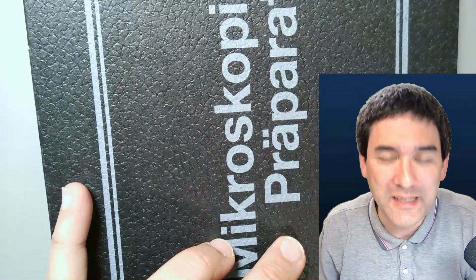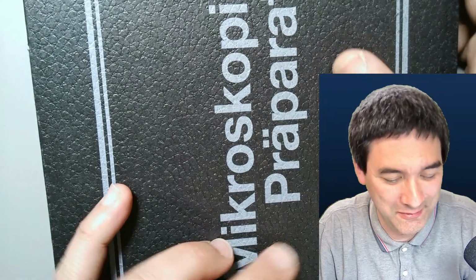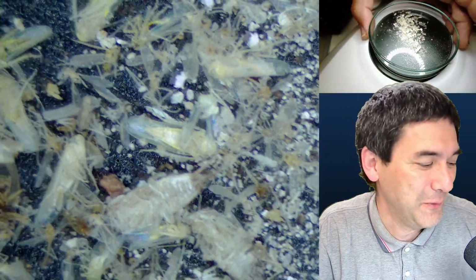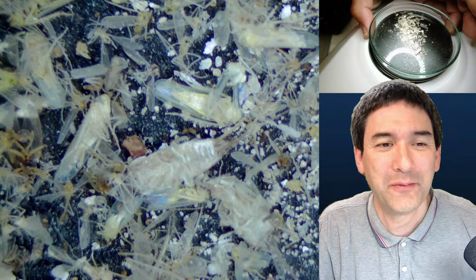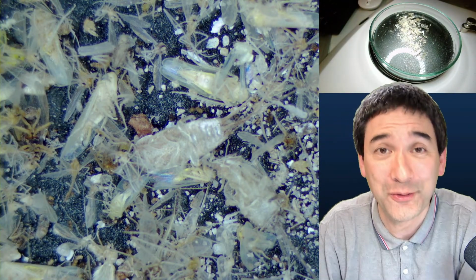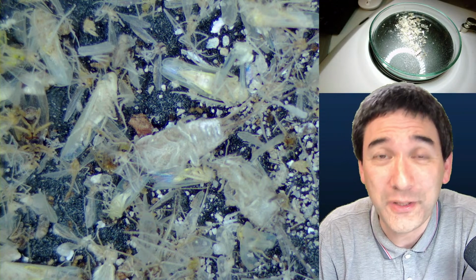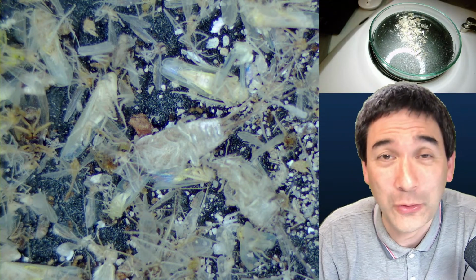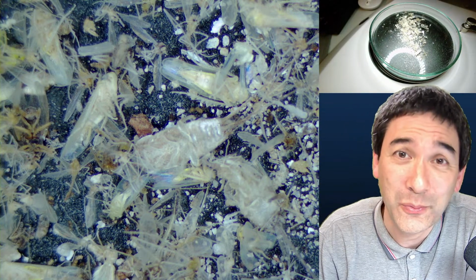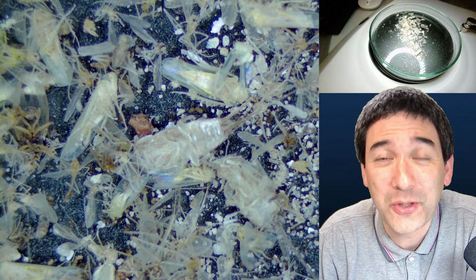how shall I put it? What people expect from a microscope is so different. And sometimes it's almost a question of a belief system, you know. I just want to tell you some of the views that I have encountered when reading books and reading online forums and videos. There are different approaches, and I'm not saying that one of them is better than the other one. It's a question of philosophy, really.